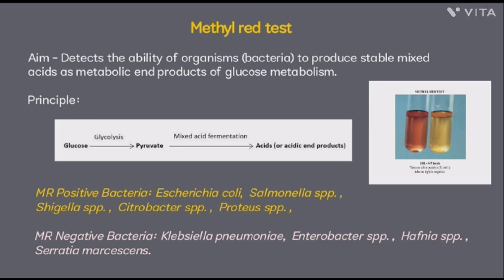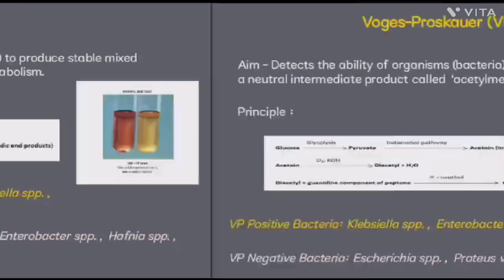Methyl red positive bacteria: Escherichia coli, Salmonella species, Shigella species. Methyl red negative bacteria: Klebsiella pneumoniae, Enterobacter species, Hafnia species, Serratia marcescens.